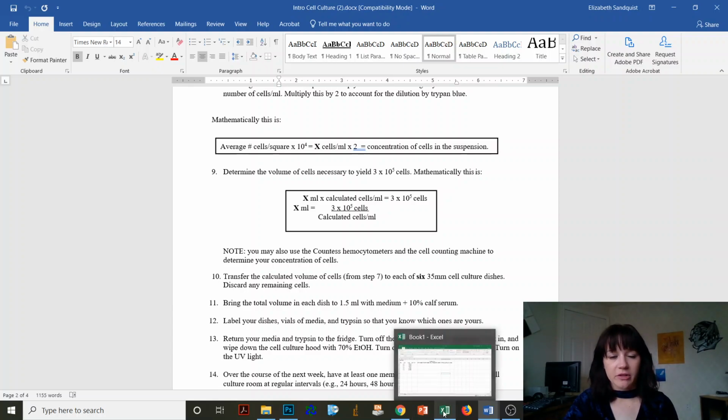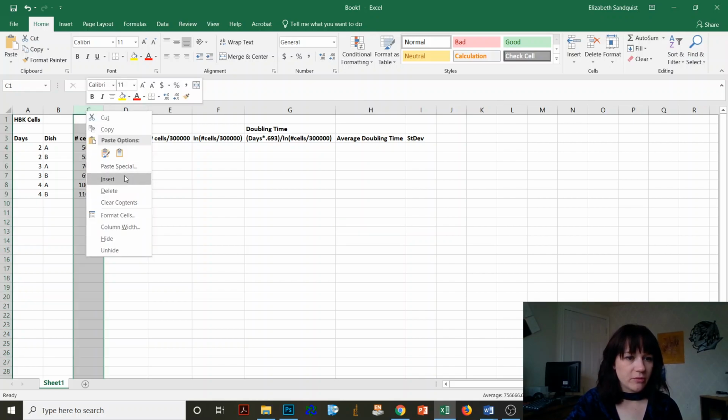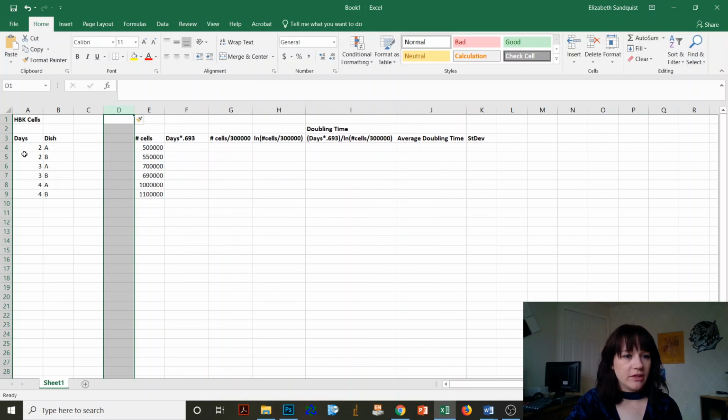So you're going to go through that and do that for all those images. And let's say here's your Excel data. And let me put in one more spot here. Let's say that this is each of the time points, 2, 3, and 4. And for each time point, we have a dish A and a dish B.